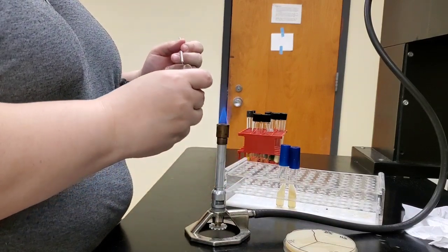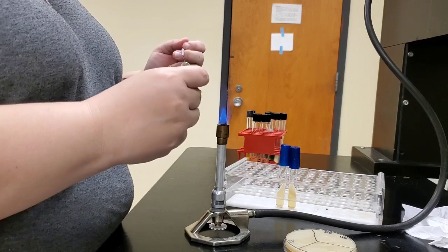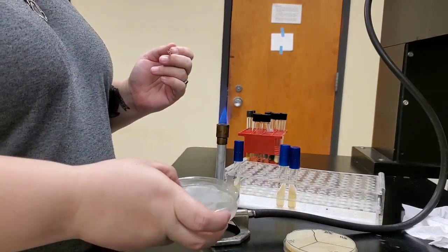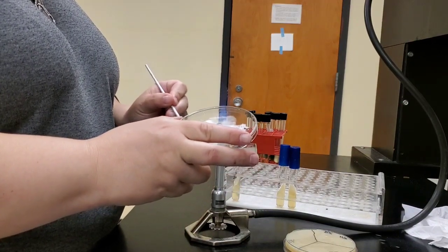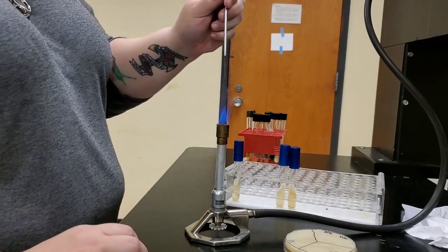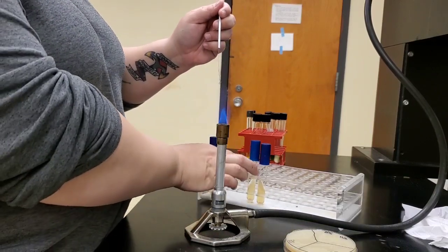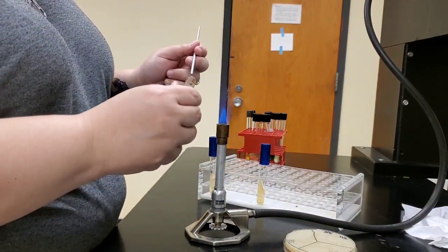A little more organism on the loop to inoculate our starch plate. Flame the loop. Obtain a second organism. In this case, Staphylococcus.